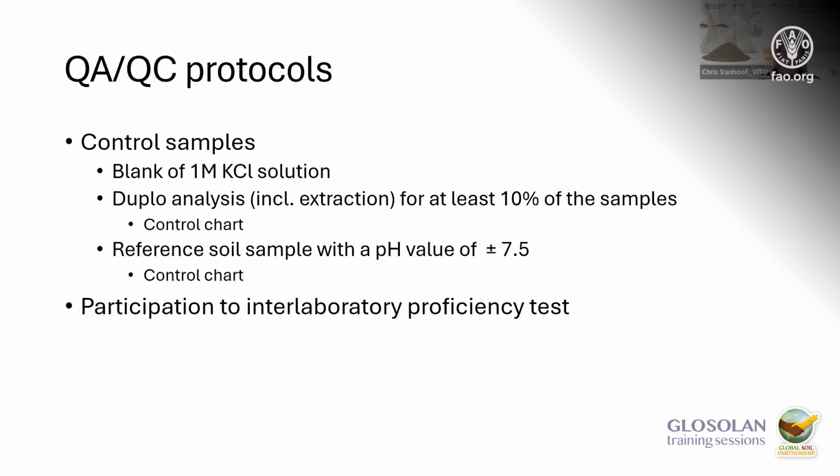And the duplo analysis not only includes the pH measurement, but also the extraction. You start from the prepared sample, you take an amount for the extraction and the pH measurement, and that you do in duplo. And these data can be followed up in a control chart.